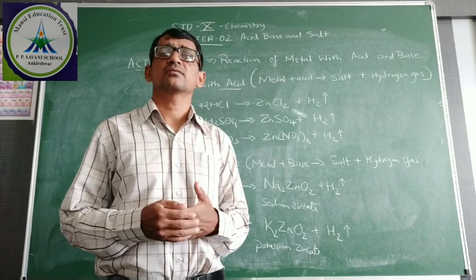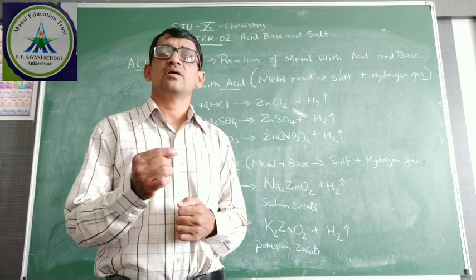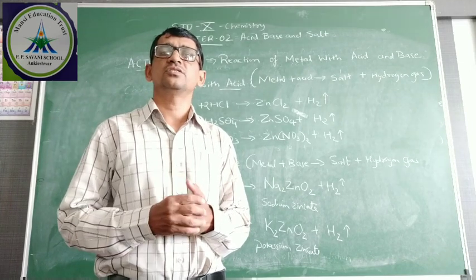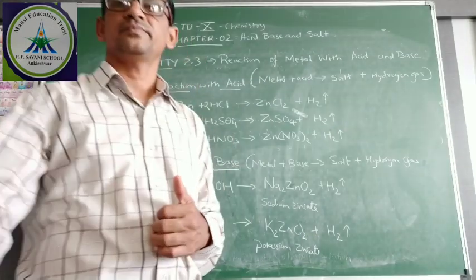This can be detected. Now we will check how the gas can be detected. Keep a flame near the bubbling of hydrogen. It gives a pop sound. This shows the presence of hydrogen gas. That we will check.